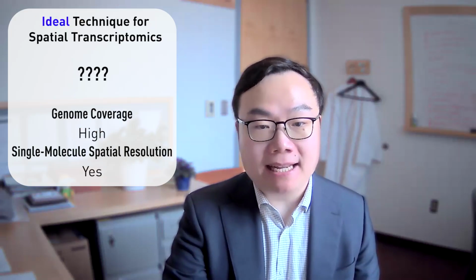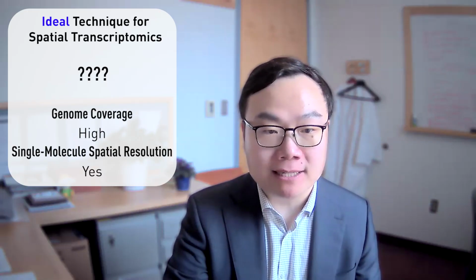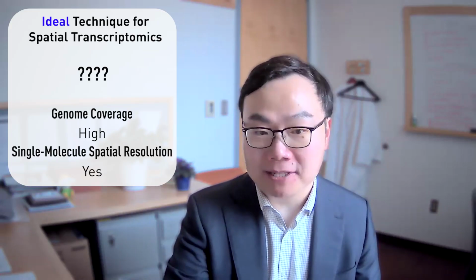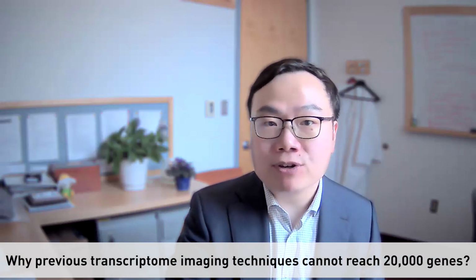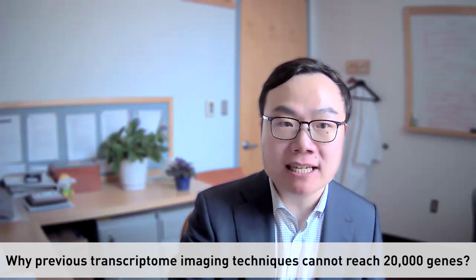So an ideal technique should have both the genome-wide coverage and the single-molecule spatial resolution. Here, we set out to develop such a technique based on imaging that by default has the single-molecule spatial resolution, and the challenge here is to increase the coverage. So why can previous transcriptome imaging techniques not reach 20,000 genes?